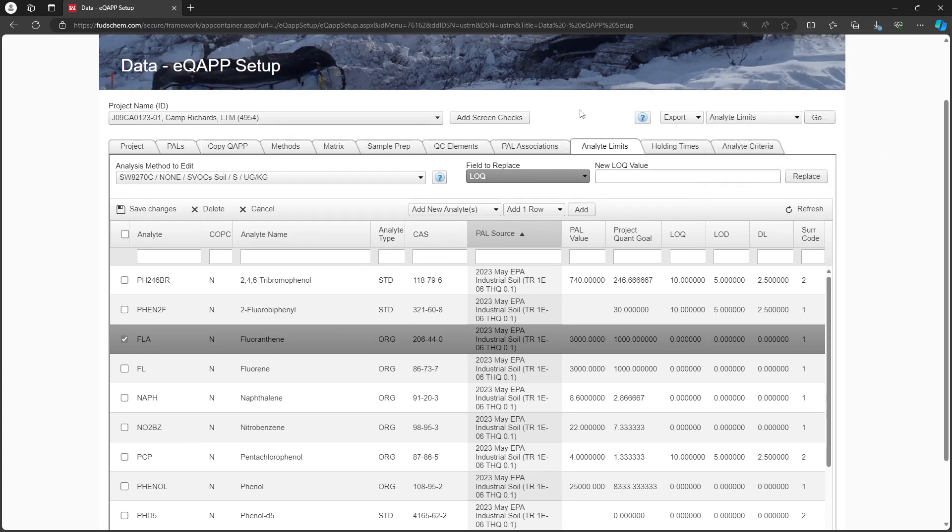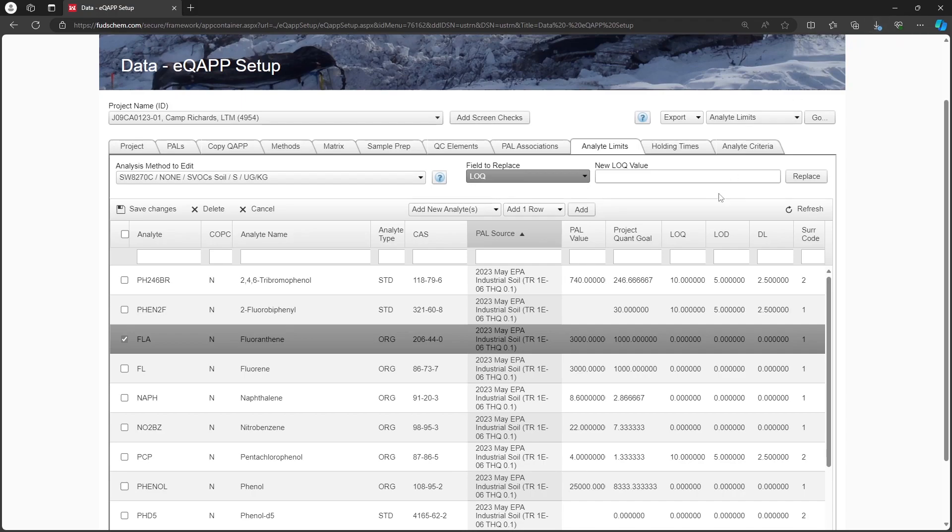Mismatches like these will cause the reimport to fail. For this example, we will only edit the LOQ, LOD, and DL columns.